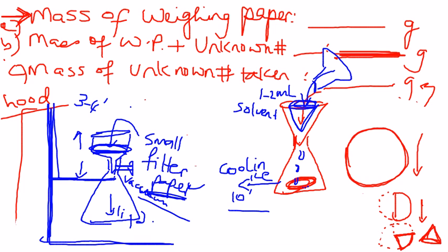If I were you, I would not use a sharp spatula to keep touching the filter paper, because realize it's going to be moist, and if it's moist, it's going to be very tender, and it can tear, and some of your material can go through. Your percentage recovery will suffer then.